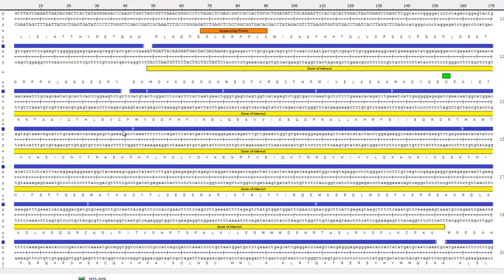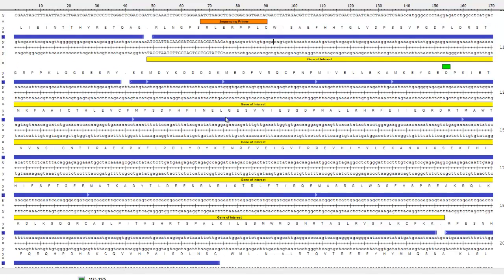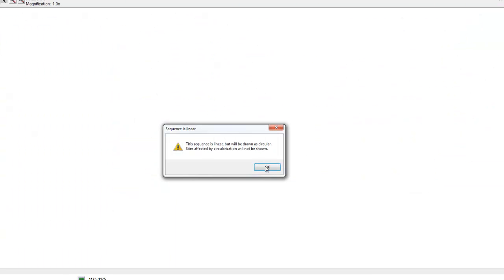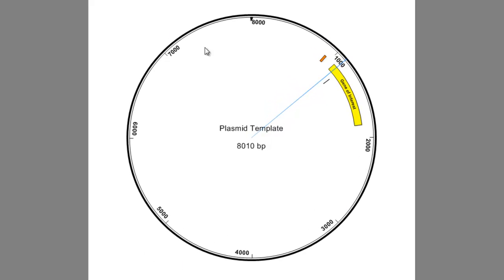If you have trouble visualizing this as a plasmid, you can put this into a circular map. And as you can see, the actual plasmid is quite large at 8,000 base pairs. And the yellow here is basically the gene of interest that I have cloned in.